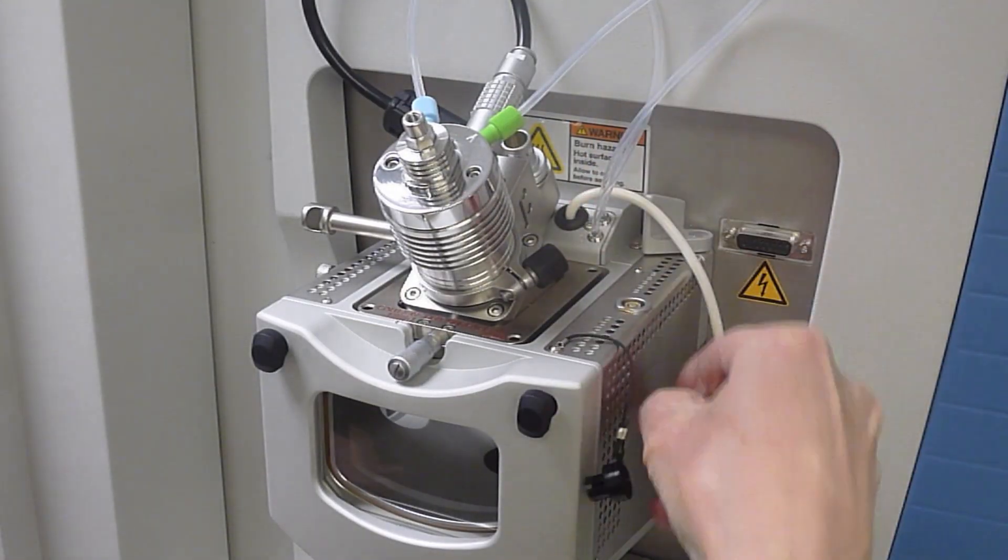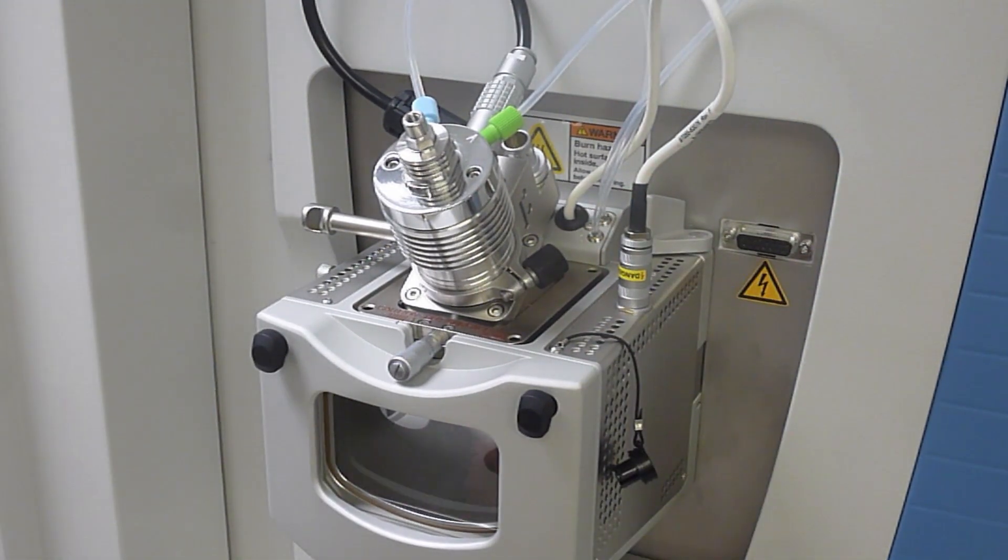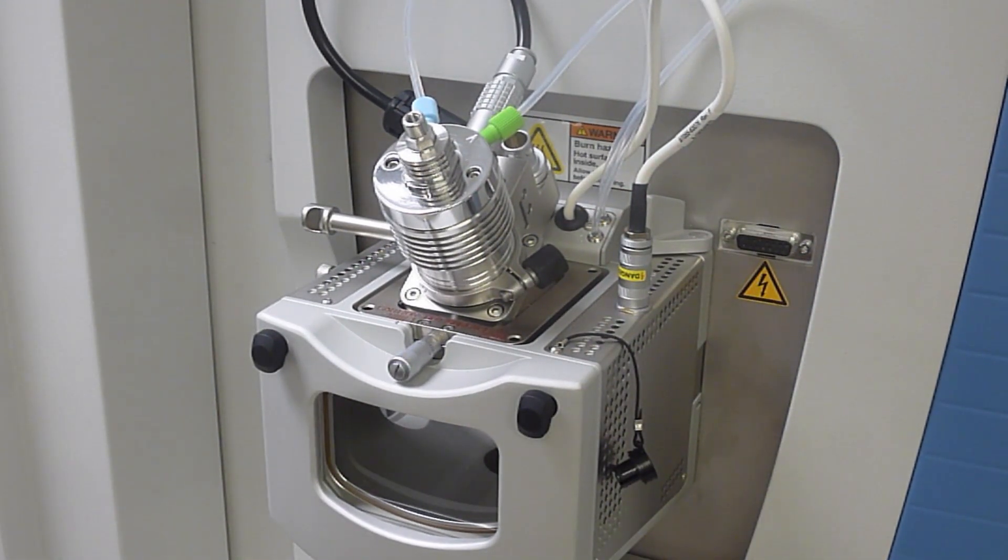Remove the plastic plug from the right hand side of the spray chamber and plug the HV cable into the socket. This is the cable that otherwise supplies the spray voltage to the ESI probe.